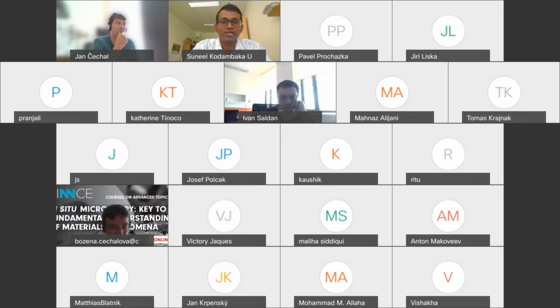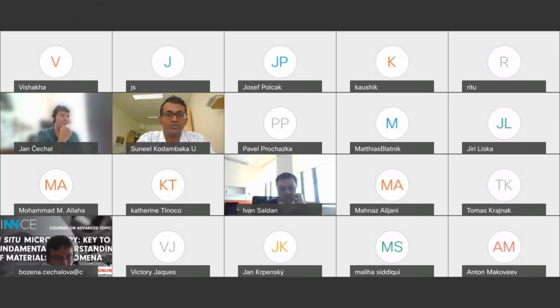So you have a gold germanium alloy with excess germanium in the droplet, and it's metastable, and its stability depends sensitively on the amount of germanium pumped into the droplet. So if you have a constant supply of germanium into the droplet, it stays happy, it stays as liquid, and you continue the growth vertically. Now, once you remove this excess germanium flux, this droplet is not stable with that much excess germanium, so that excess germanium leaves the droplet.